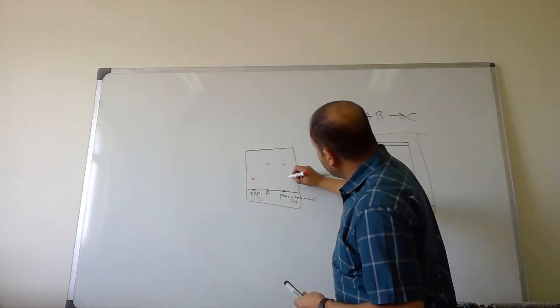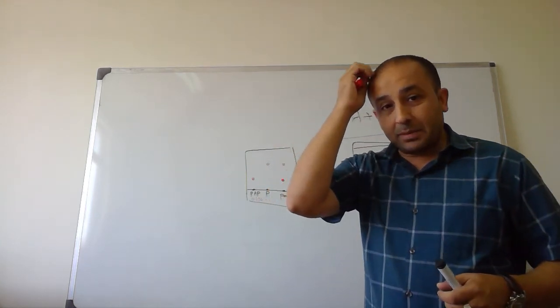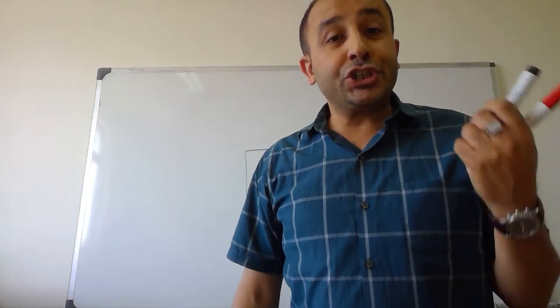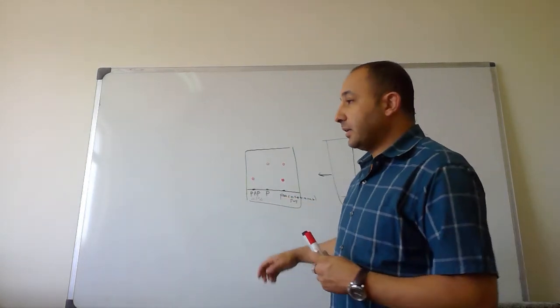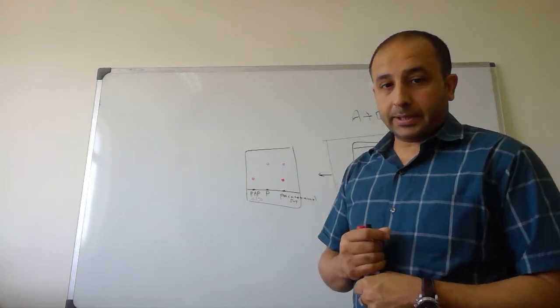But if the spot is more intense than the maximum allowable limit, here 0.1%, in this case we should reject the paracetamol suspension, and we shouldn't allow the patient to use this kind of product.